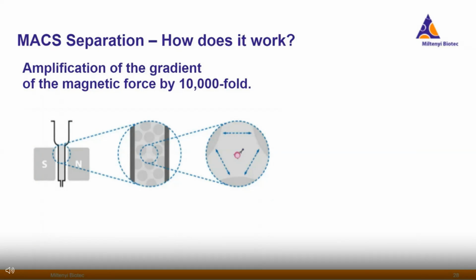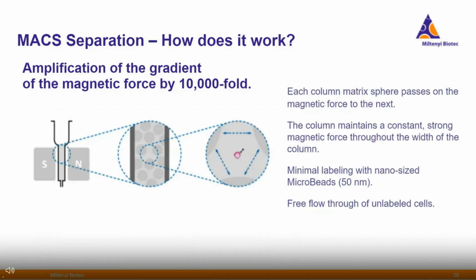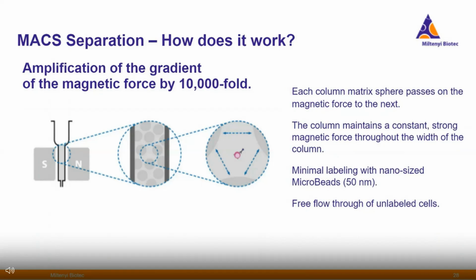So we're using magnetic particles in these columns, and the columns themselves simply expand that magnetic force. So by using the column, you're able to use these smaller magnetic particles, which have a lot of advantages. The columns have plenty of room in them for cells to go through. Sometimes people are curious about if we're losing cells in the process of even just going through the column. But for the most part, the space between the beads that are packed in the column is plenty for cells to move through, which is important because we really need cells to move through the column freely in order for this to work well.